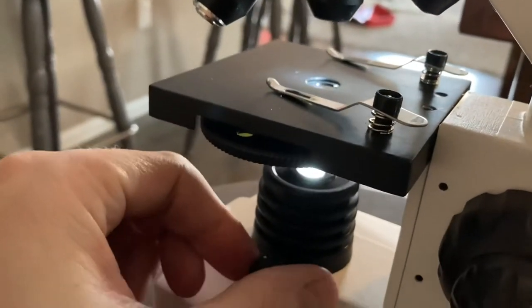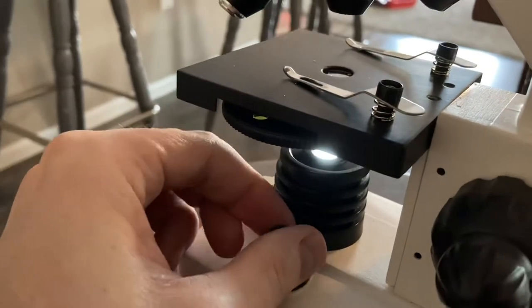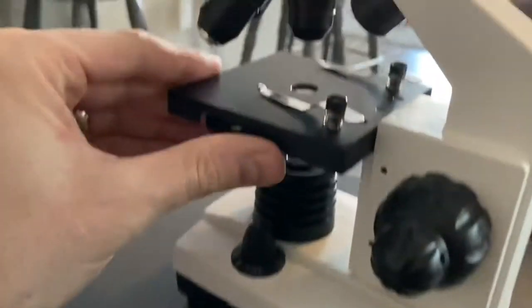It's got a lower LED light and you can adjust the brightness on it, which is a nice feature. I'm not sure under which circumstances you would need less light, but it is there if you need it, controlled with this dial right here.